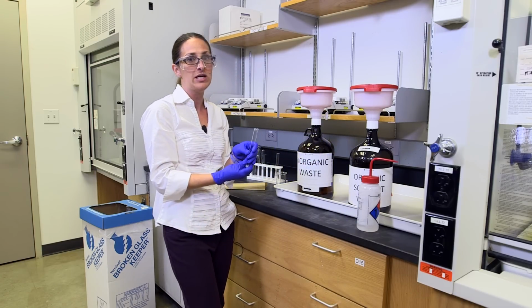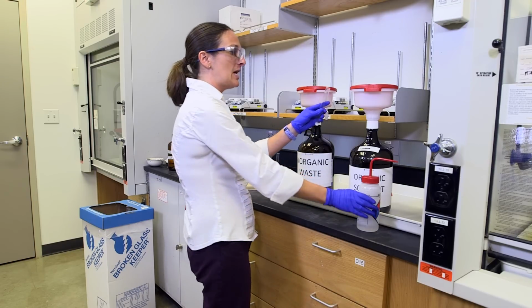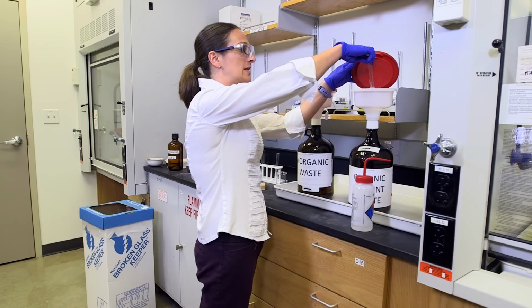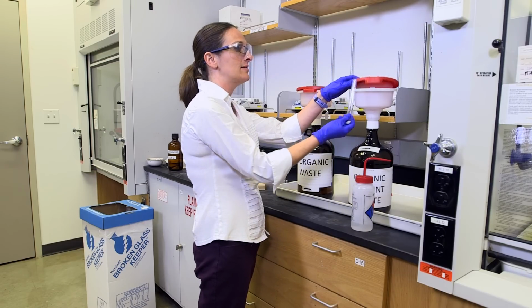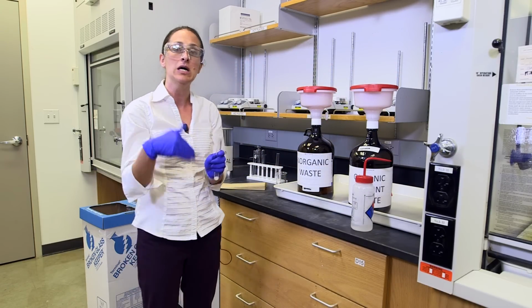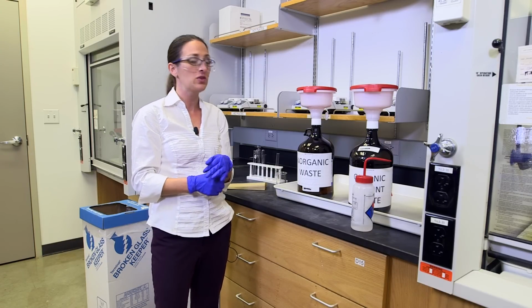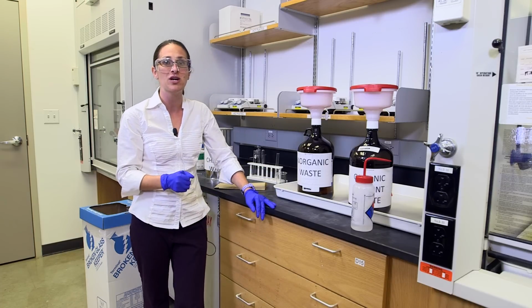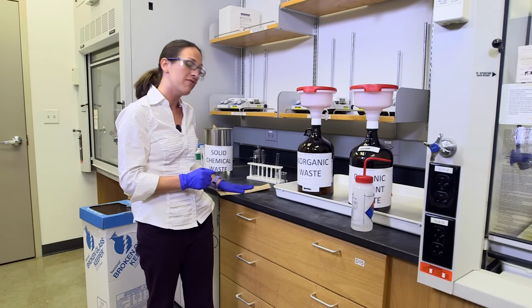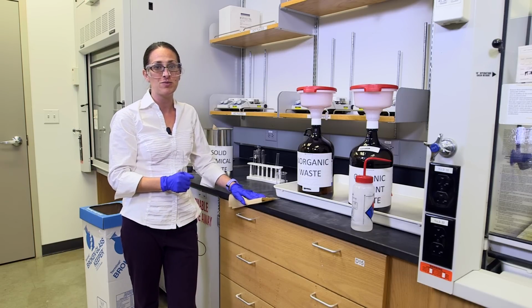All of the glassware I used, if it had anything besides just water, I'm going to rinse it with acetone. I'm going to pour the acetone that I used to rinse in the organic waste. Then I'm going to take that rinsed glassware over to the sink, rinse it with water, and hang it on the drying rack. Before you leave, you have to turn everything off, make sure everything is unplugged and your station is neat. You do need to wipe off the counters with a wet paper towel, or you could have points deducted from your lab.